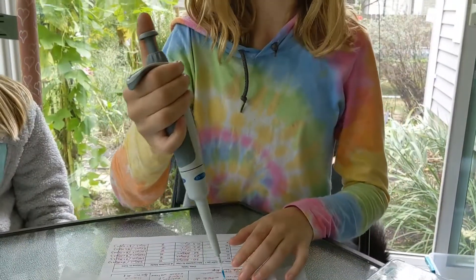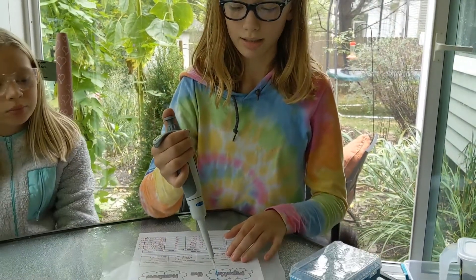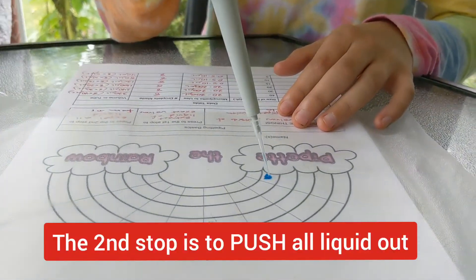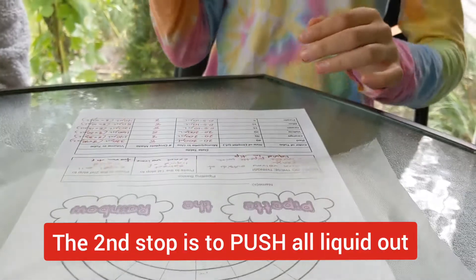You press until the first stop, but then not all of it is out, so you keep pressing until you get to the second stop. And that's your droplet.